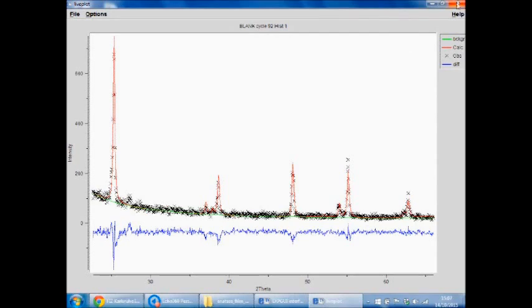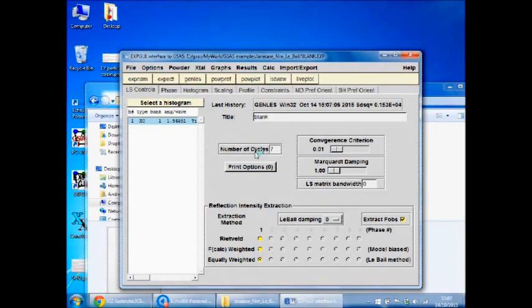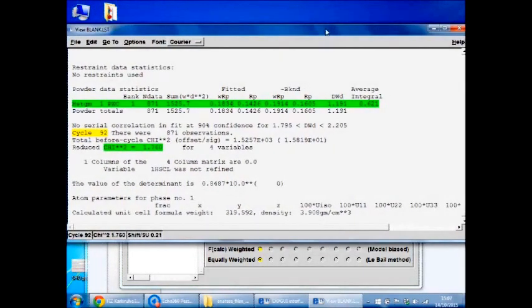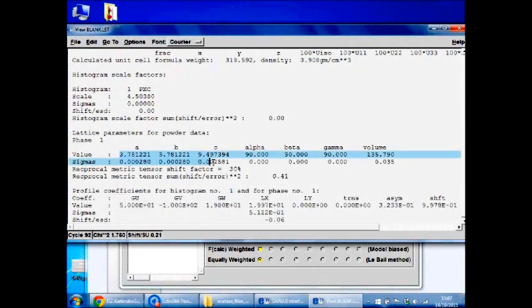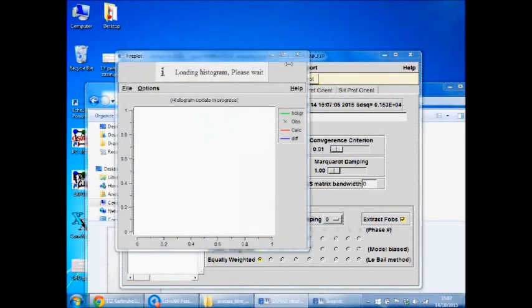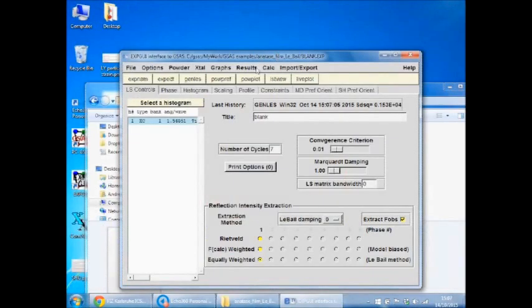So then, again, as before, you can go to list view, get your errors out to 0.18, that's respectable, and you can then extract the lattice parameters. And that's pretty much all you can get from this information, from what we've done. One thing you can do, if you care to quantify the texturing, they call it, the preferred orientation, you can go to results, ref list.